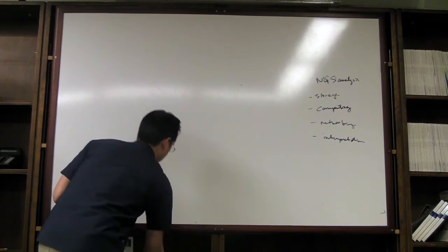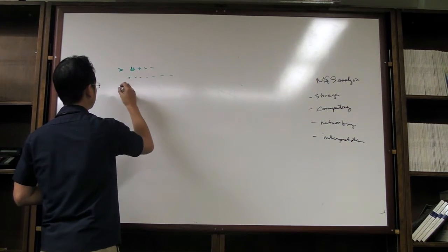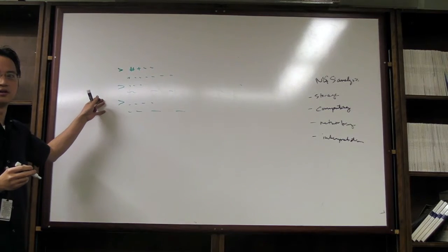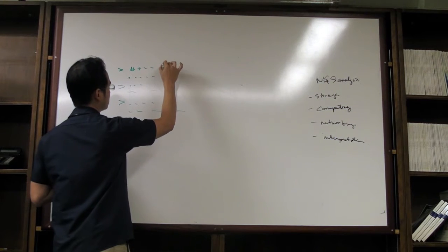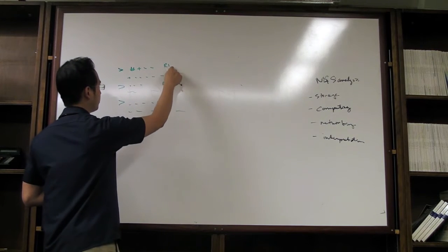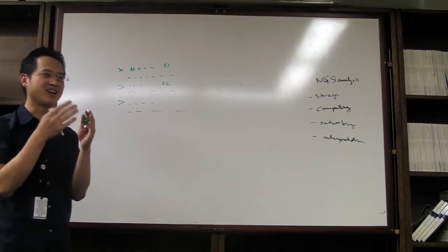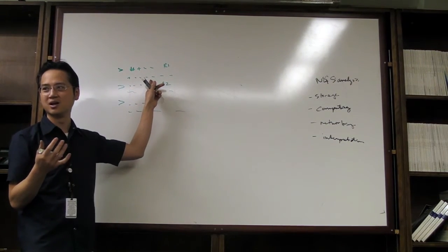So you get your data back, and all it is is sequence name, then your sequence, sequence name, sequence. You can't make much sense of this, right? This could be 100 bases, and typically, I forget how it's encoded, but maybe R1, R2, forward and reverse read, if you pair them together, it's 100 bases this way, 100 bases that way. If you just sat there and stared at it long enough, it still wouldn't make sense, right? It's just A's, T's, C's, and G's. Unless you have memorized that the sequence belongs to KRAS exon 2, you wouldn't be able to make sense of it.